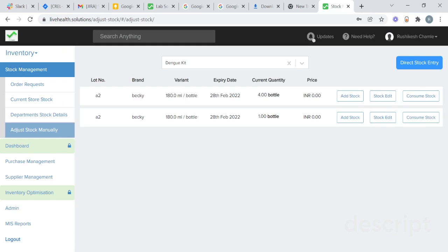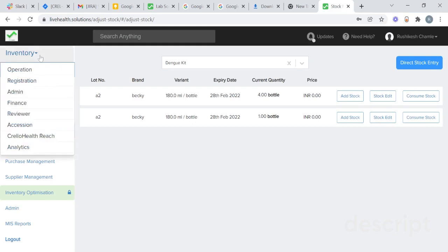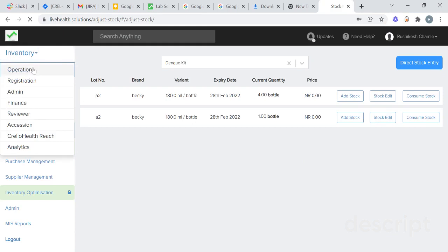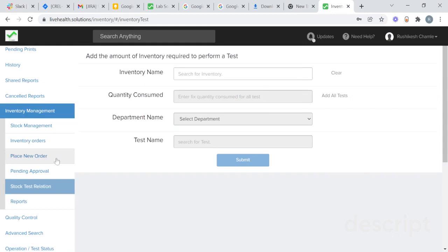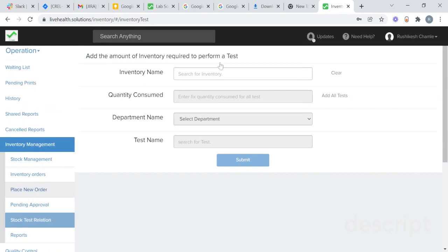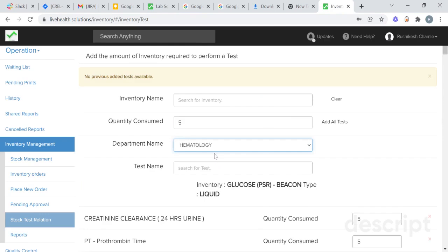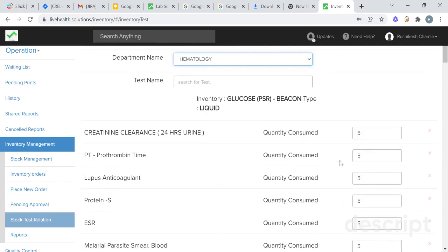You will also be able to automatically consume the particular stock by using test stock mapping. To set the test stock mapping, go to the operation section. You will need to map the stock with the particular test. Go to stock test relation, select the inventory you need to map, and add the consumption quantity and department. So that when the particular lab conducts those tests, that quantity of stock will be automatically deducted from your current stock, and you don't need to consume that stock manually.